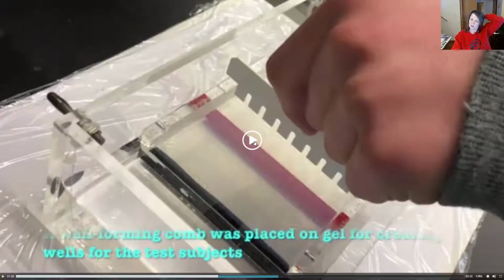Now what's missing from this video is the fact that once it cools, you have to pour that flask into the casting tray that you have wrapped with tape. The comb that you see here, that this person is actually pulling out of their Jell-O, this actually has to be placed into the tray so that little indentations in the Jell-O will be formed for day 2's procedure.